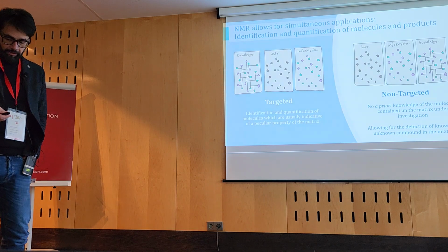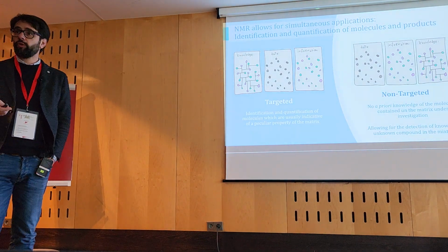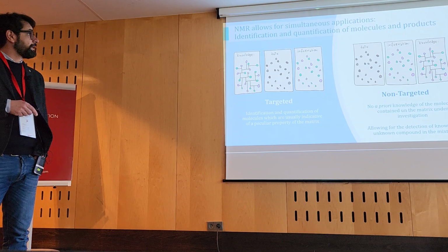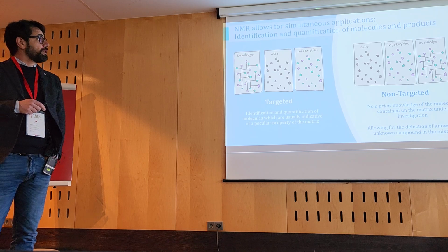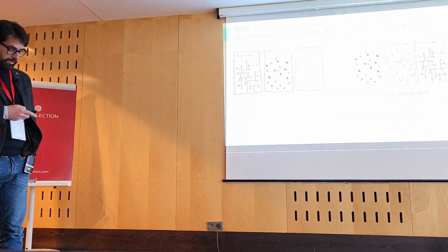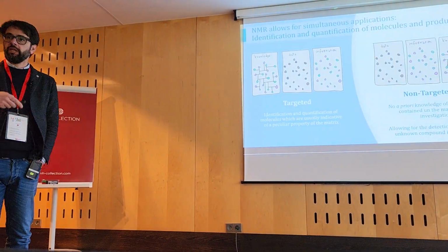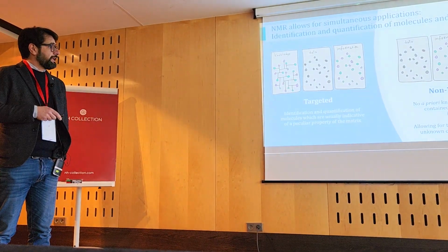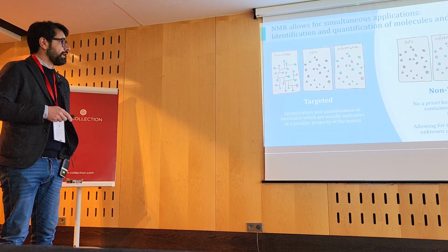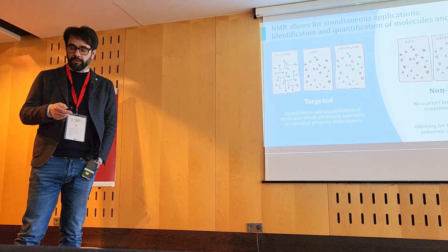But I don't need to convince you that NMR is a powerful tool, because it allows for simultaneous identification and quantification of molecules in samples in a complex mixture, combining two analytical approaches, the traditional targeted approach and the new non-targeted approach.